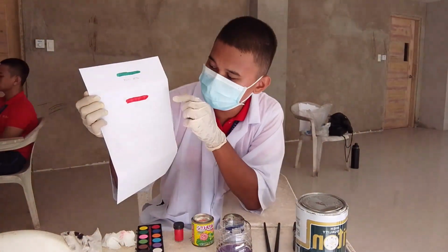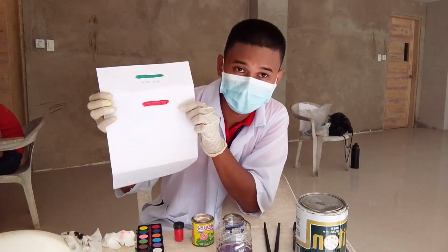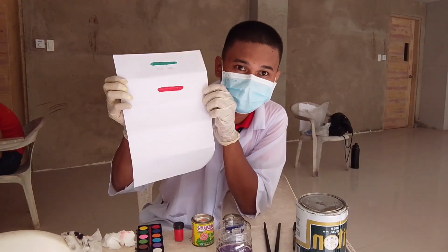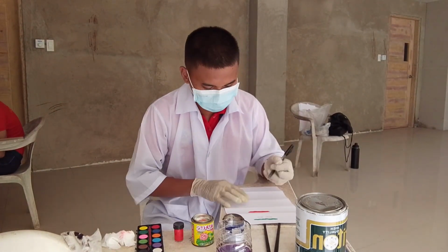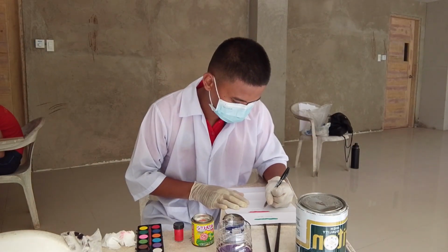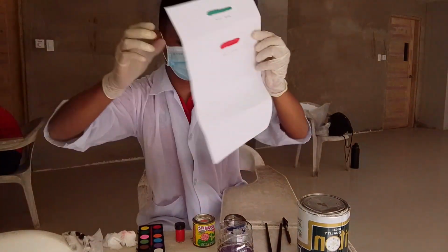For the color, I chose red. For the shade, it is also a light shade. And the paint type is also water-based, an acrylic base method. So I will now label this. I am done labeling the acrylic paint.